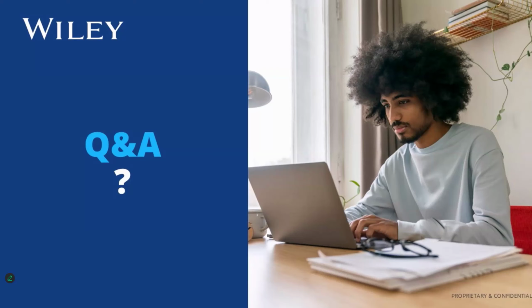Great, thank you, Michelle. Here's one. I am currently using KnowItAll for IR analysis. I also use GCMS in my lab. Am I able to get a trial of the GCMS? Yes, please contact us through our website or our sales manager. We do offer trials, so people should go for it. Yes, they can access the request a quote link on our website as well.